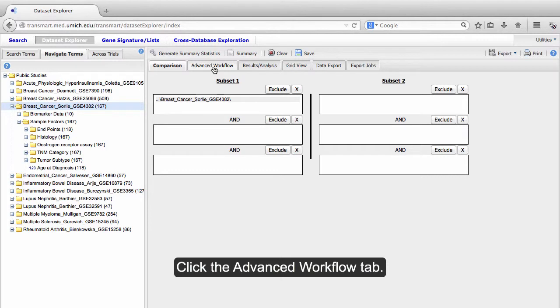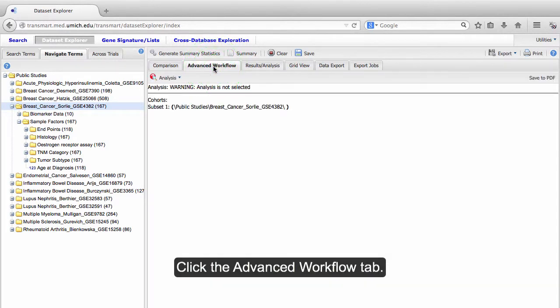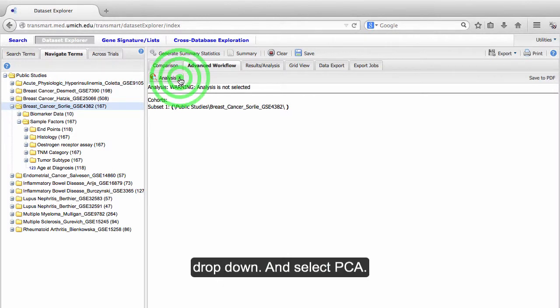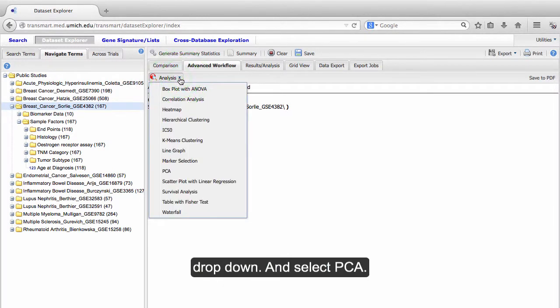Click the Advanced Workflow tab. You will see a button labeled Analysis. Click the button to open a dropdown, and select PCA.